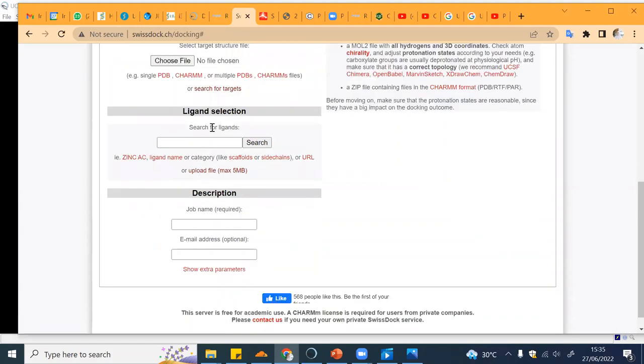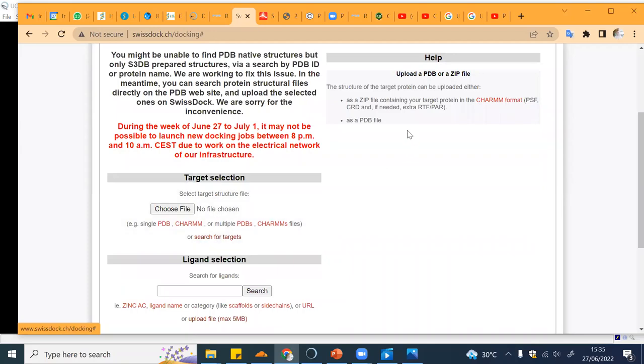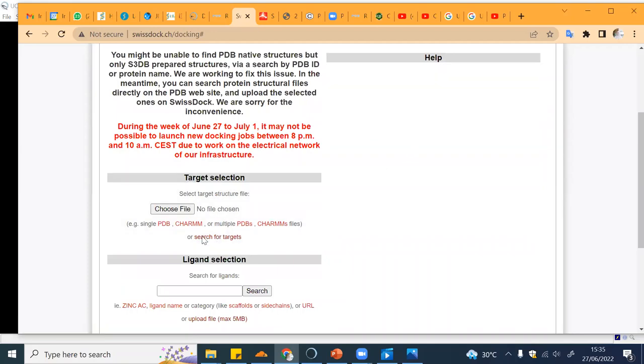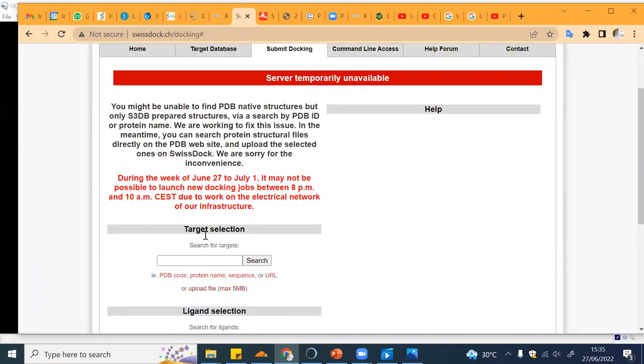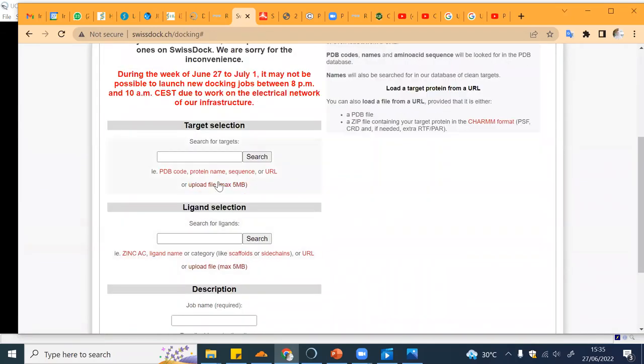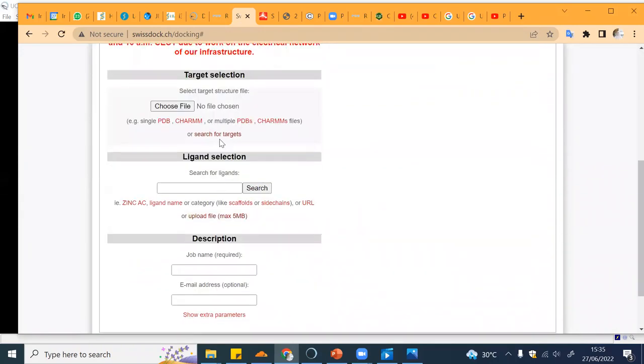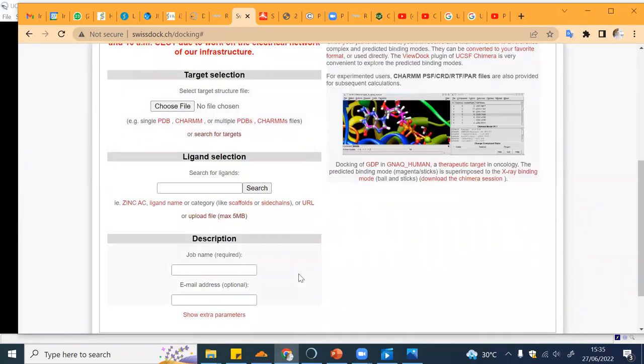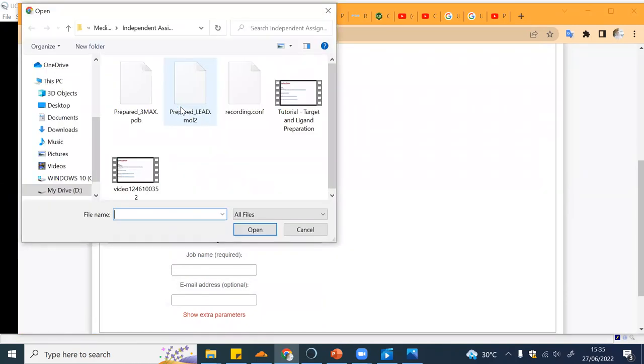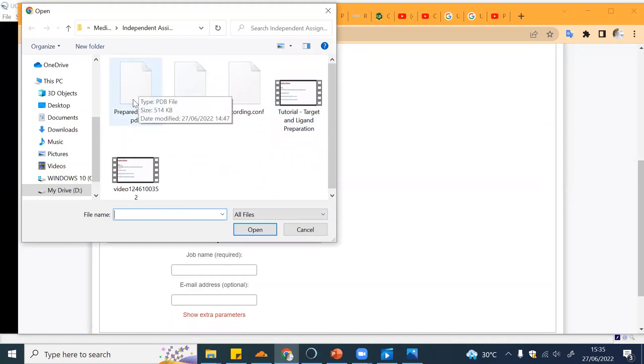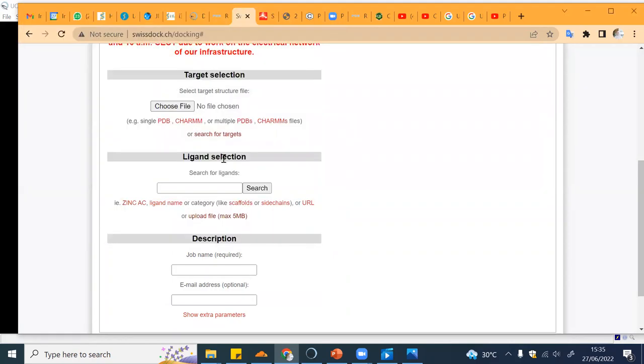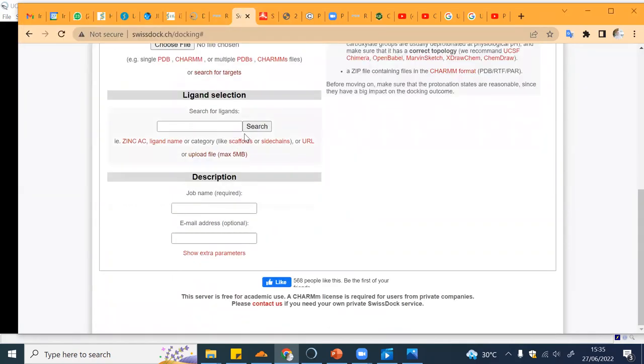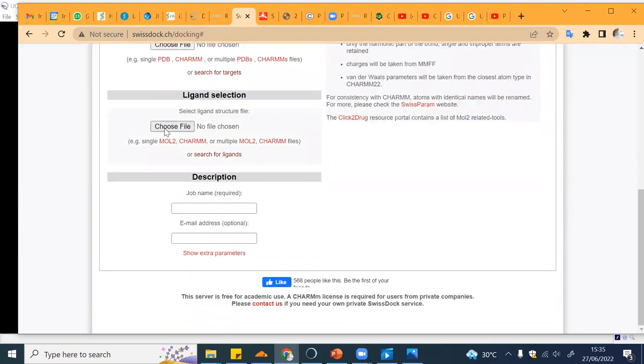Over here you can just upload the PDB file. You can search for target or upload file, right click, and then choose file. For example, I already prepared the 3MAX structure in PDB file so you can just click on that and it will be uploaded.